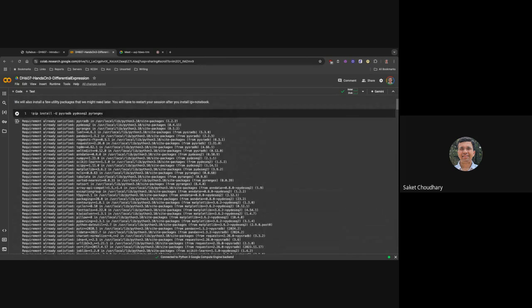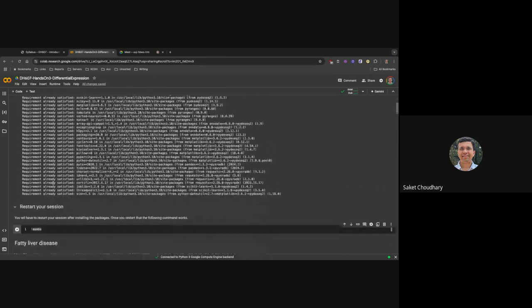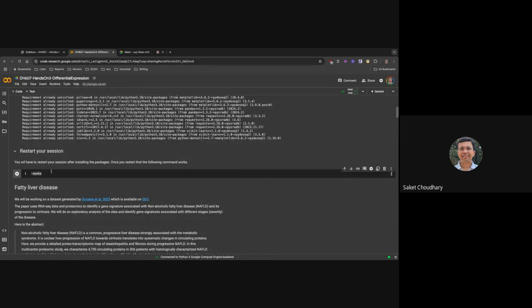Okay. So everyone with me so far? Okay. Tanzeel? It's loading. Nikhil? Done? Okay.